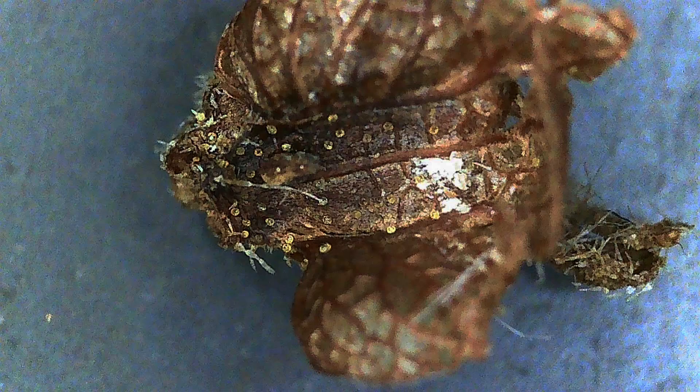I also took a look at a dried bit of basil flower, and you can see some nice amber trichomes on the top of this. So even when the basil fully dries out, the trichomes stay attached and they're still there, even when it's gone fully to seed.